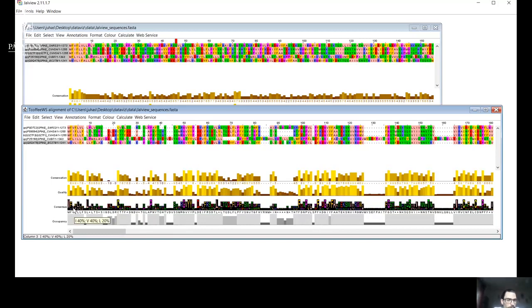Here the letters also appear, but with smaller sizes. And in the pure consensus sequence, there is nothing here. Here also there's 100% P, while here there is only 20% L. In the other cases there is a gap here.